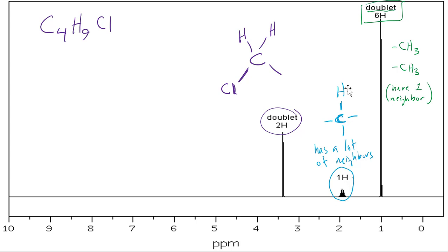Thinking about how we would put these 3 pieces of our puzzle together, we have 1 piece with multiple connections and 3 other pieces that have only 1 connection. Like the corner piece in a puzzle, there's only 1 place each of these can go, which is on the end of a molecule.